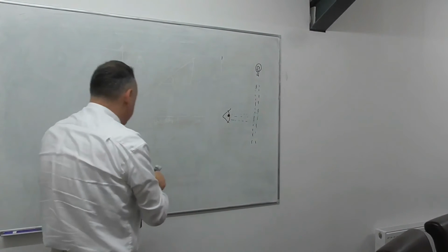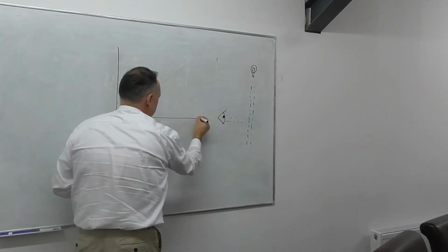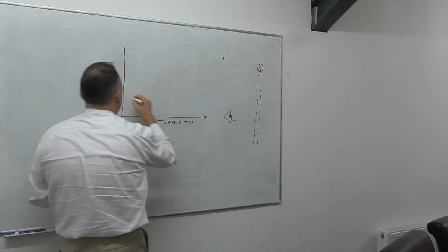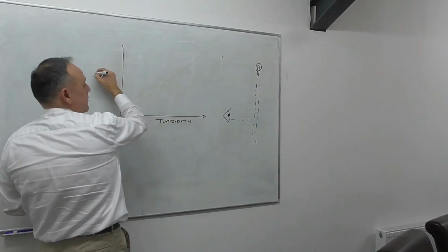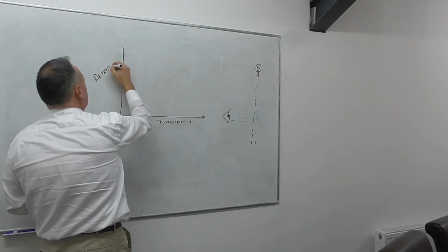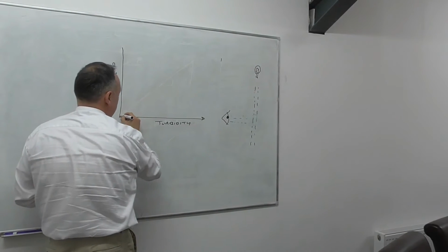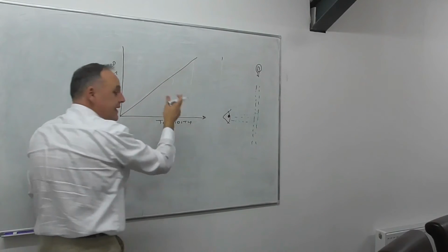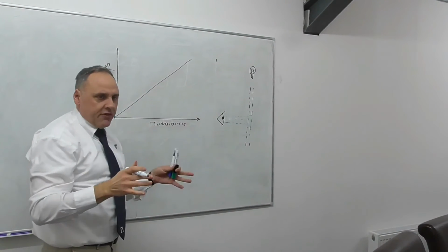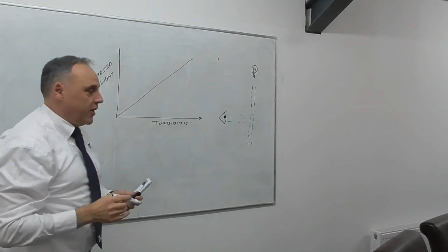So we end up with a situation like this, where the detected light goes up with turbidity. And it's linear up to about 200, and then after that we linearize it with some clever software, but generally from 0 to about 200 it's a linear response.